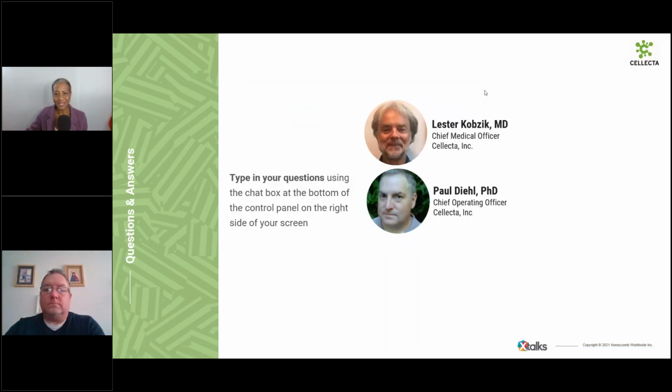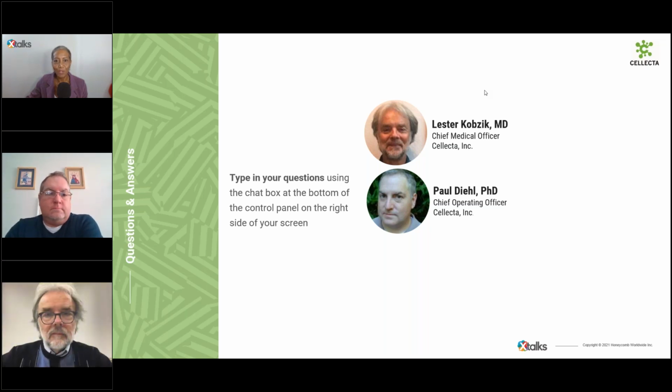Hi, everyone. Okay, here's our first question from our audience member. This audience member is asking, how long does a spatial transcriptomic project take from start to finish? So how long does it take? Who would like to answer that one? I'll go. It's pretty easy to answer. Assuming everything works well with the validation of the antibodies, et cetera, roughly 3 to 4 weeks from receipt of the sections to data and report.